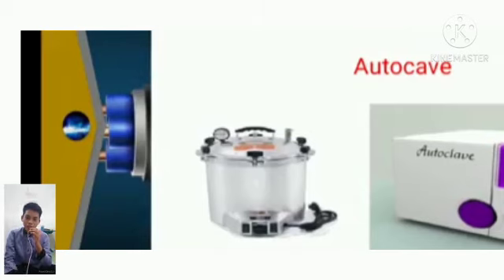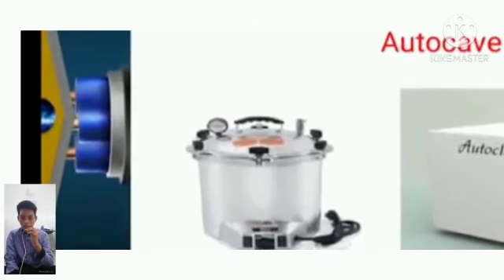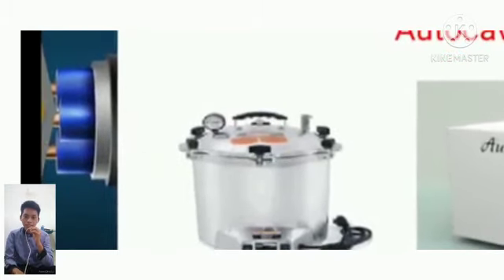Some types of autoclave, this type of a pan style, use a stove for heating, but some use an electric heater for heating. Usually it also still has an analog temperature and time control knob.